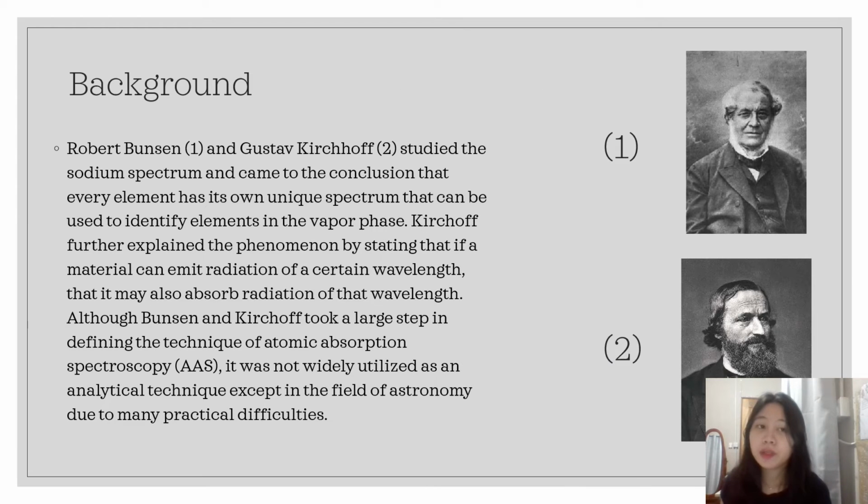As for background, I am going to do a summary based on this paragraph. This is Robert Bunsen and this is Gustav Kirchhoff. They both concluded that in a vapor phase, each element has its own unique spectrum.